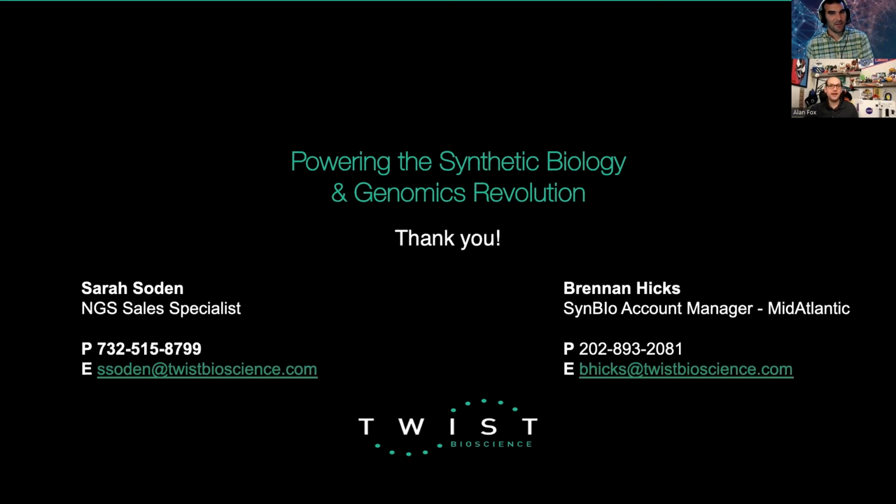That's a great question. I actually had a crazy idea eventually of using our exome probes to deplete for human and then go into bacteria. That's a completely different story, for microbiome. But on the RNA side of things, more often than not, people just use it to enrich, less to deplete. I guess you could do it, but more often than not, people think, well, I only care about these transcripts, so I would rather just sequence them and not worry about the background, as opposed to trying to pull out the background and see what's left. Okay.